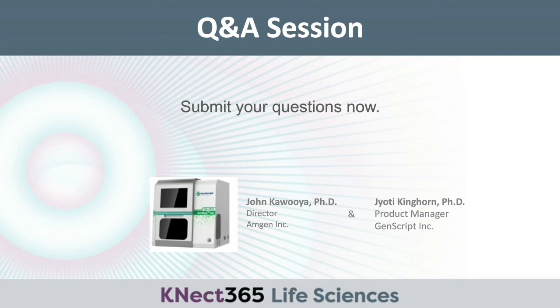Yeah, I could chime in here because I've been addressing this question. One of the big challenges with the magnetic bead has been trying to reduce the elution volume. The tendency is that because you're doing it batch-wise, you tend to repeat a number of elutions. So I've developed some elution buffers which can allow you to elute these proteins in very high concentration and a very low volume. One elution step and all the protein comes off the beads. So the bead volume ratio is no longer a big factor now.